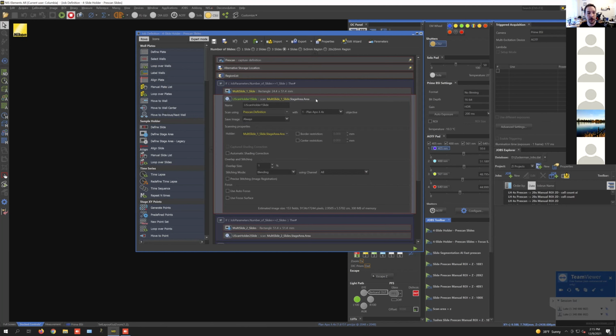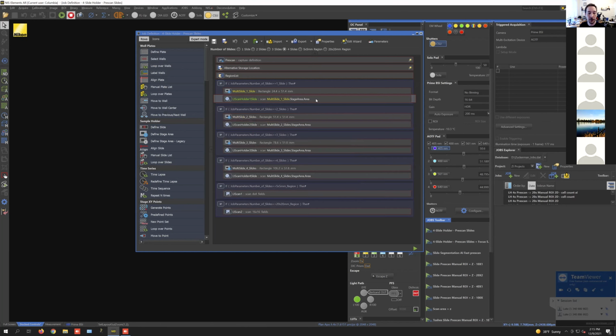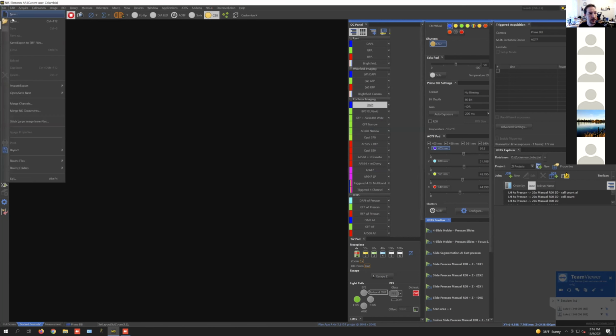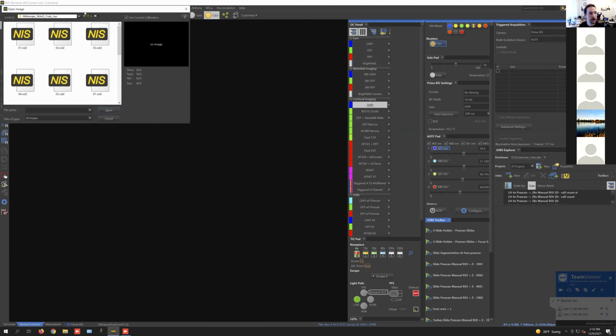And doing this, we can image a slide in about 2 minutes per slide. So very quickly, in 8 minutes or so, you'll have a map of all 4 slides on the microscope. And we'll go through this step by step to build a job. I just wanted to give you a quick walkthrough of one of these existing jobs first. From a job like this, we could get an image, and I have an example image that I can show you before we get started.